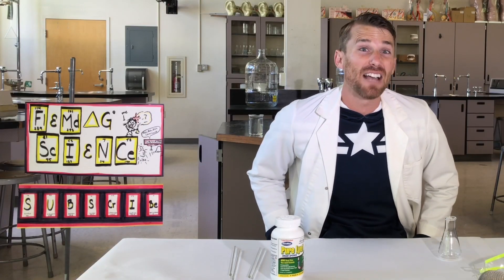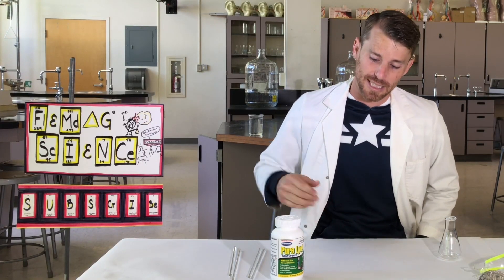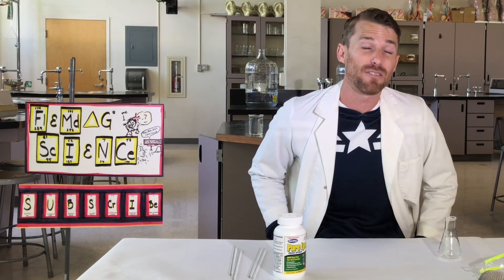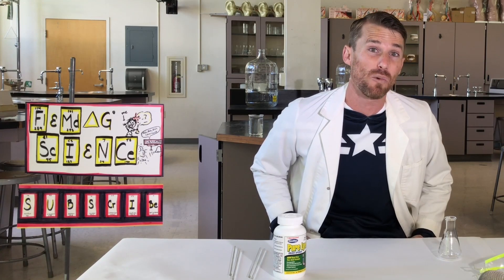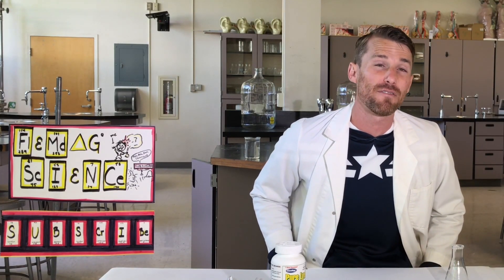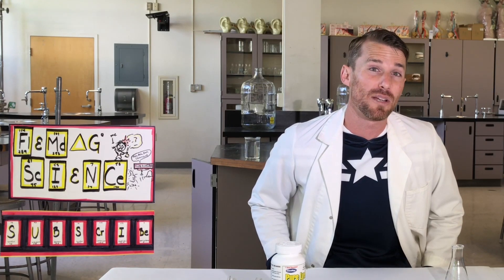Let's go measure out 5, 10, and 15 grams of sodium hydroxide — I'll be using pure lye right here. That's going to go in five different Erlenmeyer flasks with a little less than 50 milliliters of water in each one, making us our 2.5, 5, and 7.5 molar solutions of sodium hydroxide.